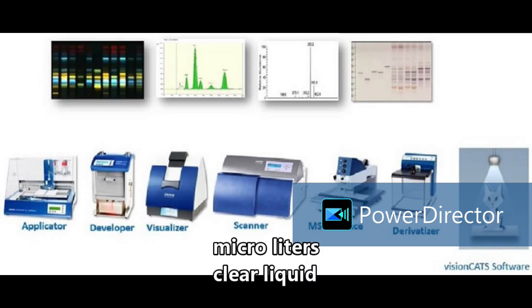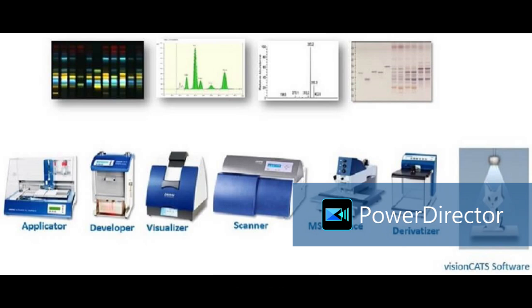Always, after each application, if you want to use the same machine for some other exhibit or some other material, then how is the cleaning done? Yes, that is a very good question, because in HPTLC all these modules you can use simultaneously. If I am applying samples on a plate, one of my colleagues can be doing detection using the visualizer, or scanning using the scanner. So we can use different modules simultaneously, and each plate is a new stationary phase.